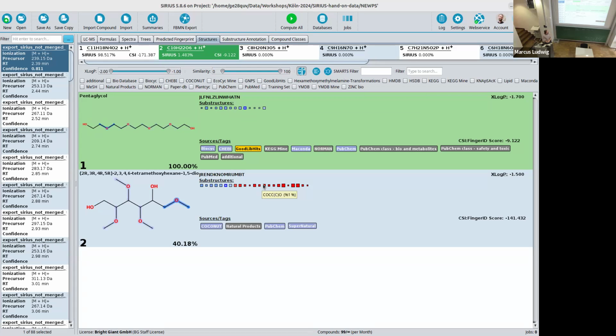Here for the candidate, for example, this is a substructure we predict not to be present, but it's in this molecular structure in here. You can also just overlay all of them, and then you see that this is basically a very bad match to our predicted fingerprint. This is just for visualization, to give you an idea if this match was good. The method just ranks by score.